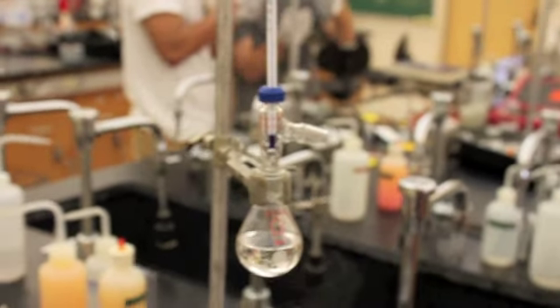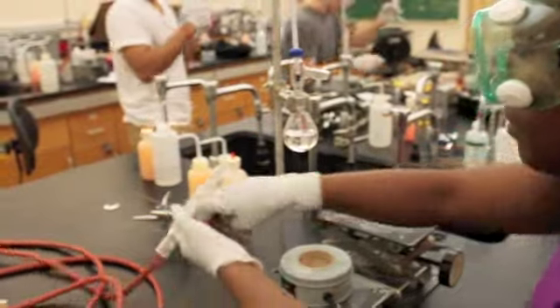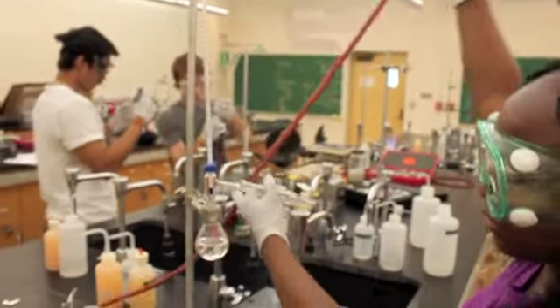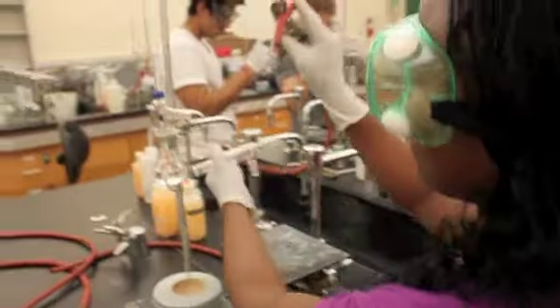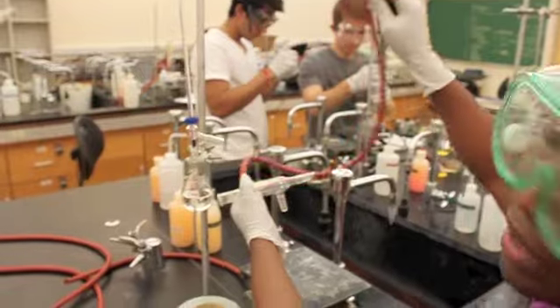So take your condenser. You want your condenser to be just so. Now again, grease the joint a little bit. You'll have one portion which is where the water is going to go out, and ensure you have a clamp holding the end of it so that the water doesn't splut out when it's coming.